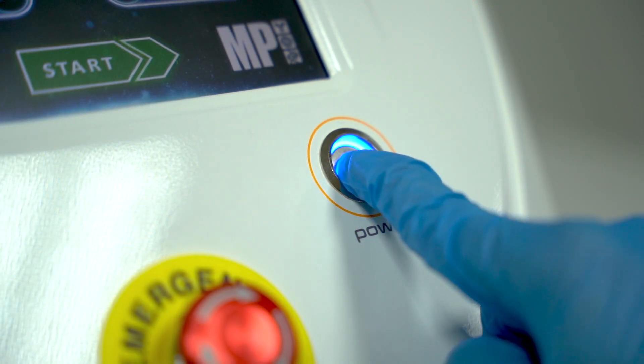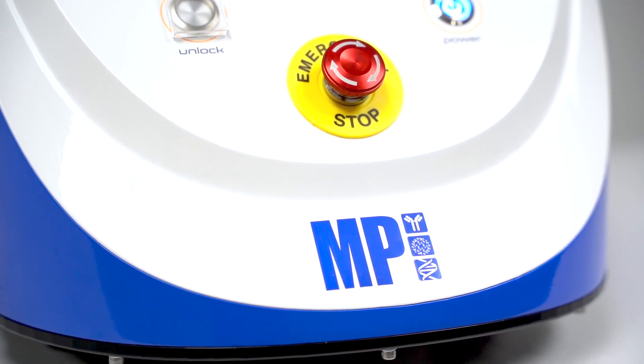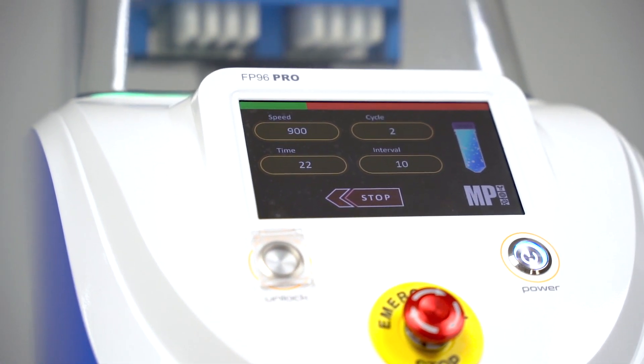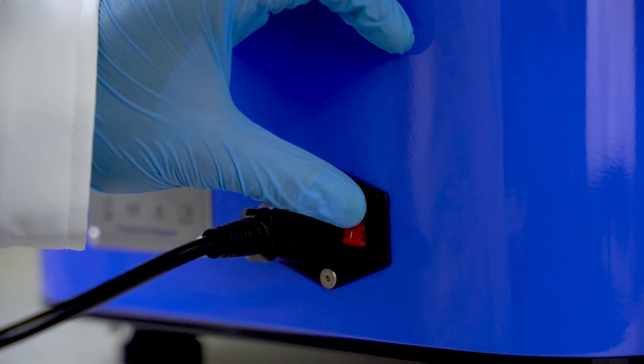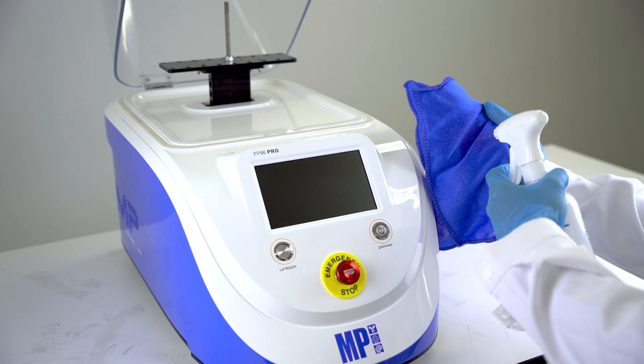Shut down the FastPrep 96 PRO by pressing the power button once your operation is complete. To ensure the machine's long-lasting performance, clean the instrument regularly. Unplug the power cord and wipe the instrument with a soft, damp cloth and a non-corrosive cleaning agent.